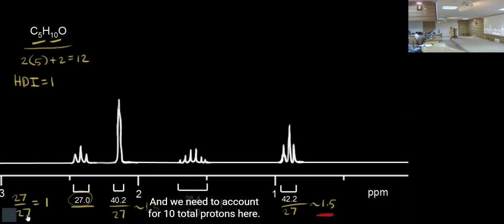So there are many chiral centers. Since most of us work with natural product chemicals, there must be at least one proton. You might think there is no one proton in your mind, but in natural products that is very, very rare.